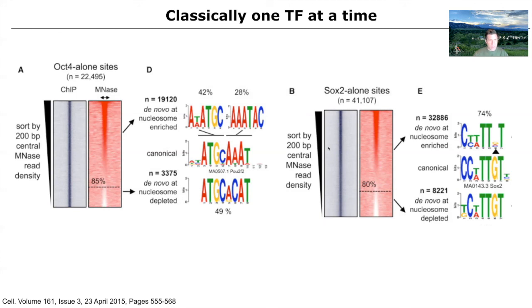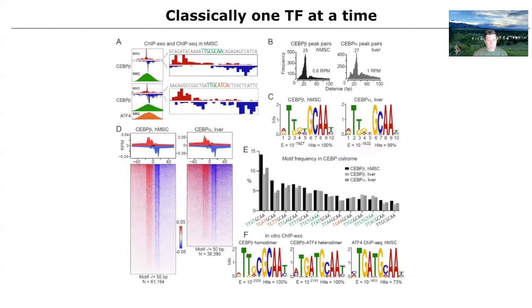Okay, so these are sort of heat map meta plots where you center something and you can't really see an individual gene, but you can start to see the patterns of different categories within the gene. For example, these have no binding activity down here and down here, but these do have binding activity of histones that package DNA. These are just more meta plots.